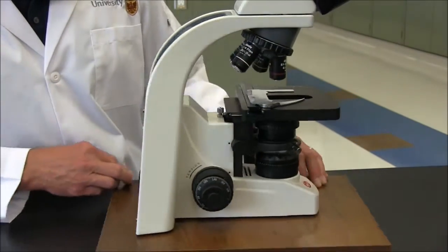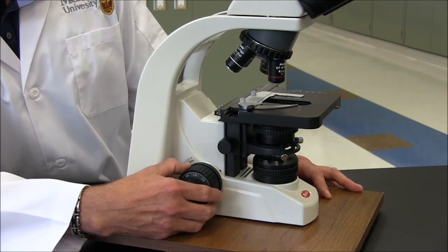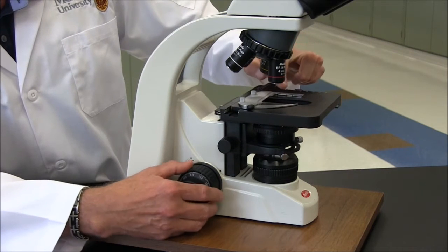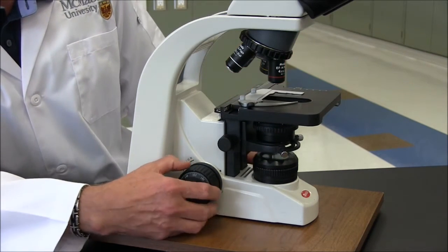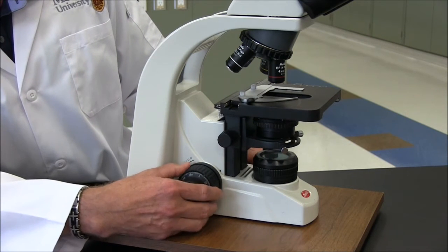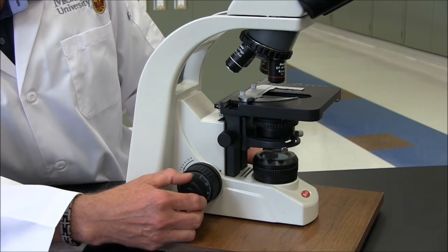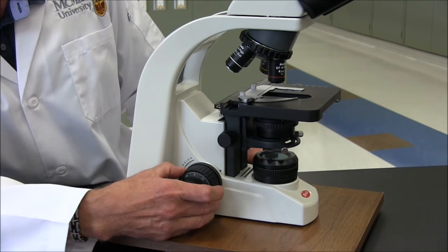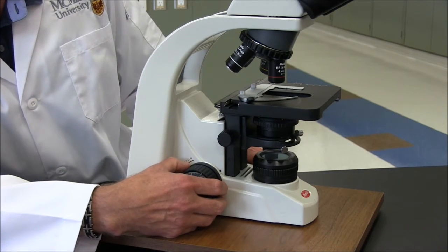On the left side of the microscope is the coarse adjustment knob and the fine adjustment knob, and these move the stage up and down and change the focal length between the objective and your slide. As they indicate, the coarse adjustment knob moves the slide up and down quite a bit, and when you get close to being in focus, use the fine focus knob for your final focusing. This tension knob controls how easy it is to move these two knobs here. Normally this is set so you don't have to change that.